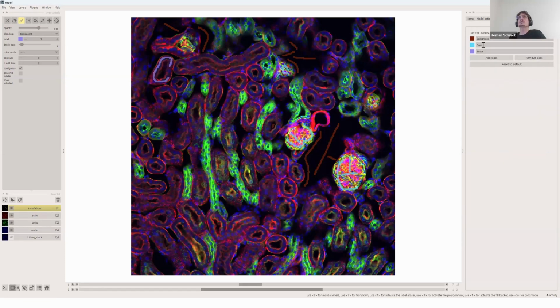And we can actually go here and call that, as I said, so these are maybe, let's call those circles.